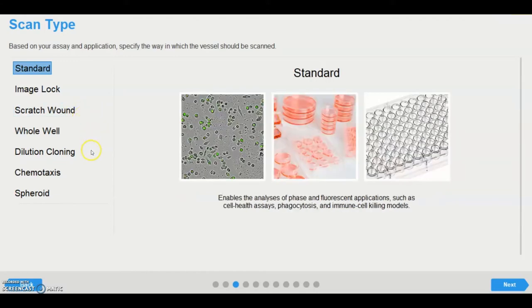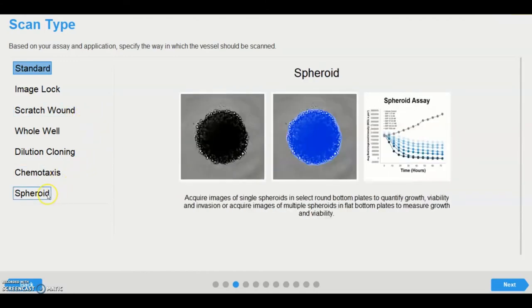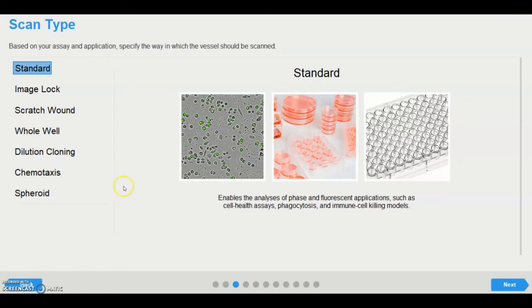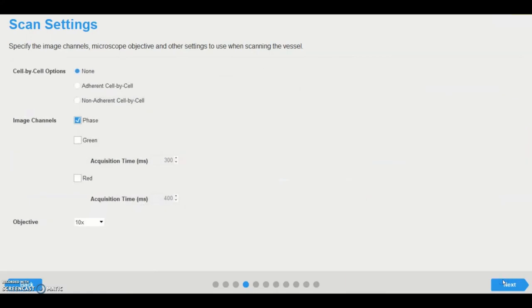The scratch wound, chemotaxis, and spheroid scan types are enabled upon purchase of the applicable software module. Most assays, such as proliferation, cell death, phagocytosis, and 2D immune cell killing, are run using the standard scan type. Standard scanning also allows the selection of the cell-by-cell scanning options, should the module be enabled.